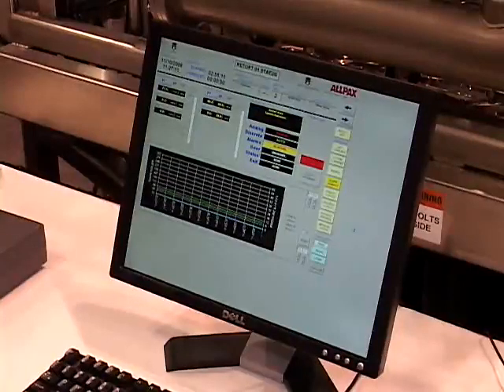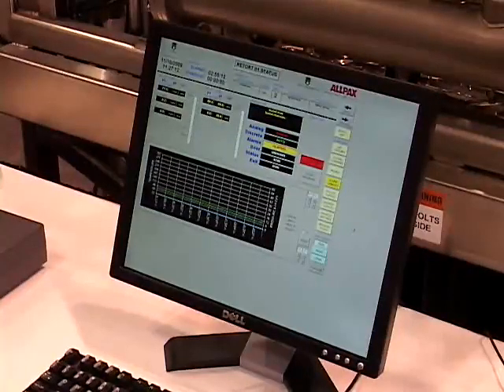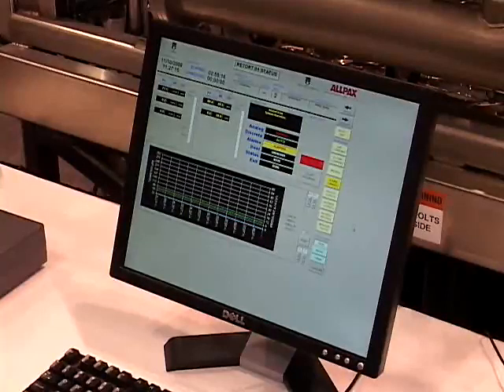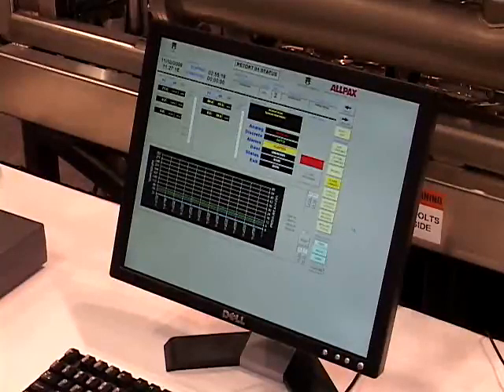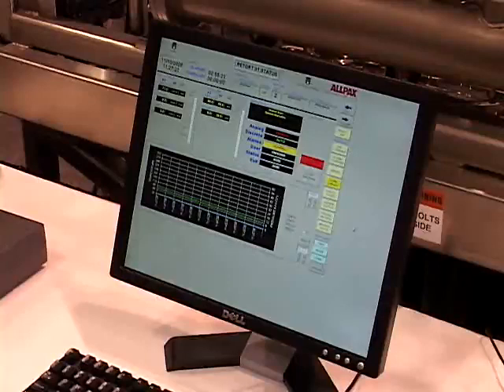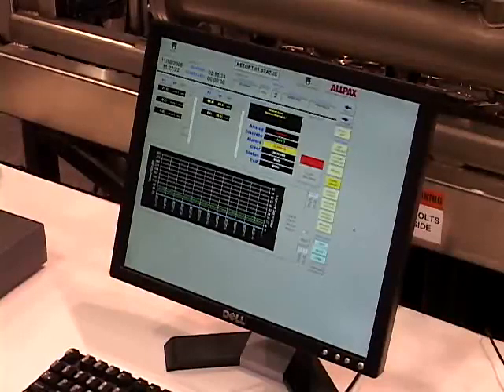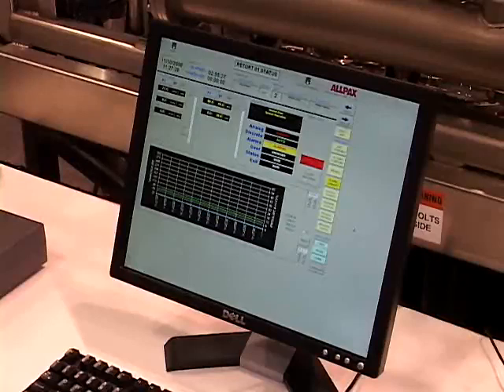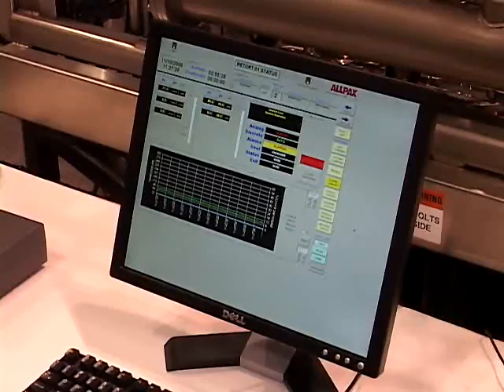The 2402 Flex R&D Retort comes complete with an Allen-Bradley PLC control system and the Allpax host monitor system, where we can select different types of processes and agitation modes, as well as control the type of process parameters required by regulatory.